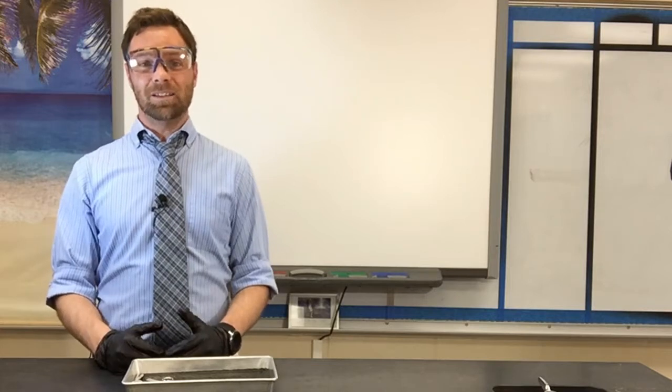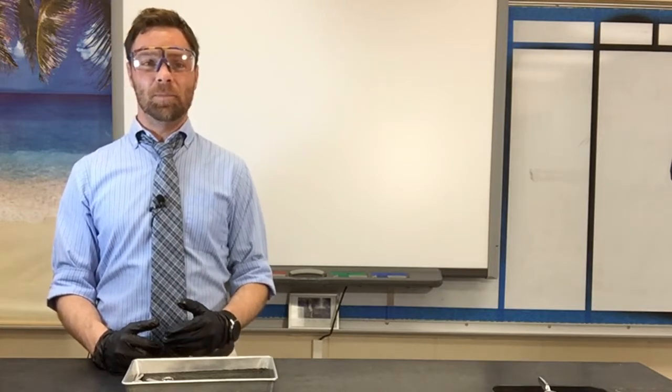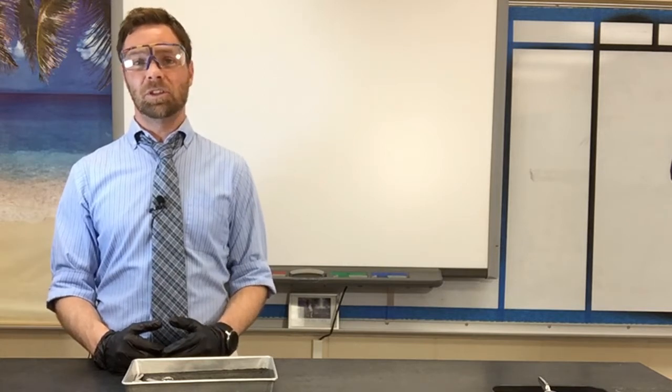What's cool is we got to see some of the major parts of the eye, and what's interesting is that many of the tissues are very similar to your own eyes.